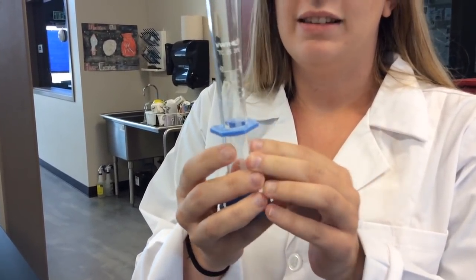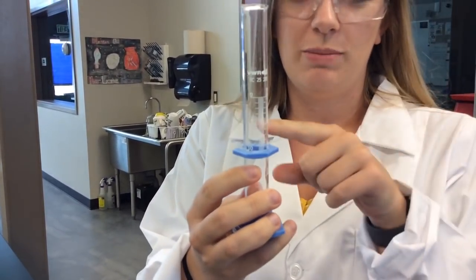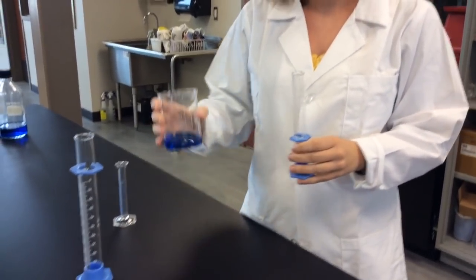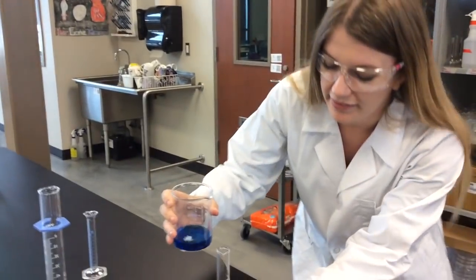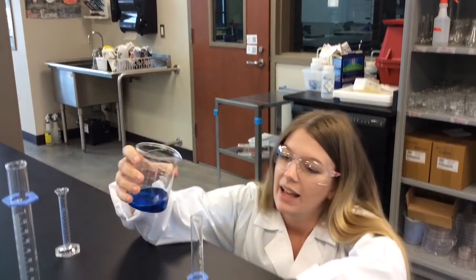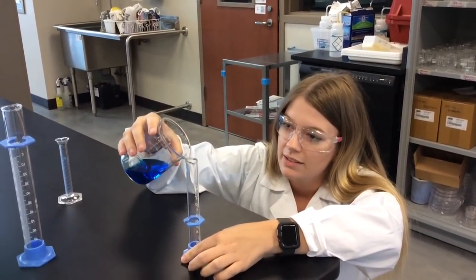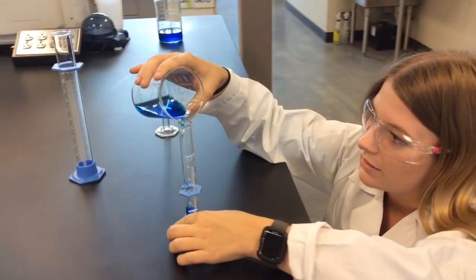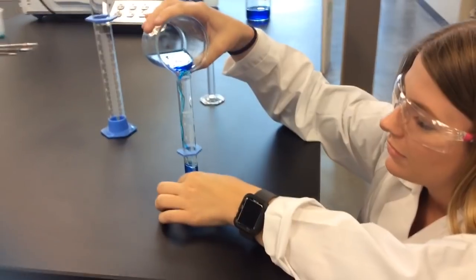What this does is it shows us where the meniscus should be hitting. So what we're going to do is carefully, hopefully I won't spill this, put it on the table and get down at eye level and slowly pour, and carefully pour.